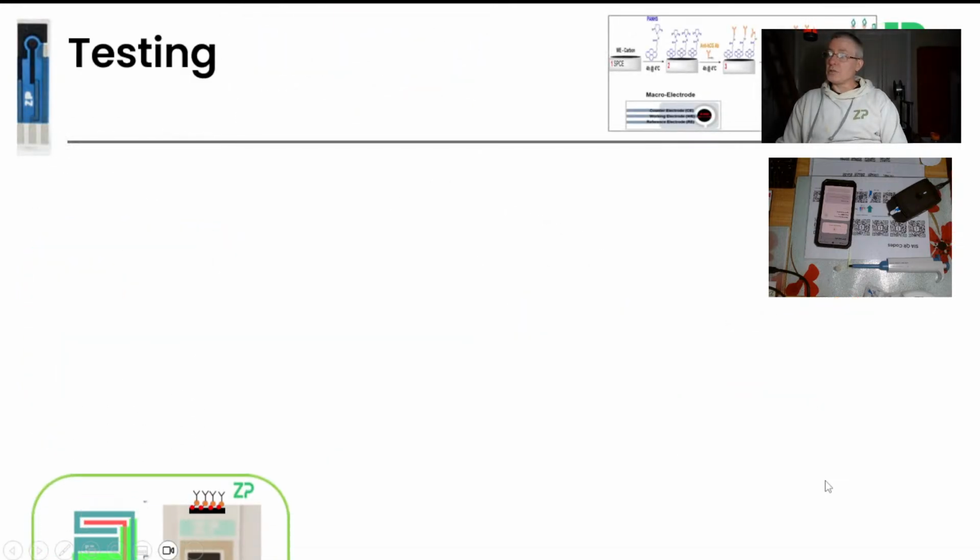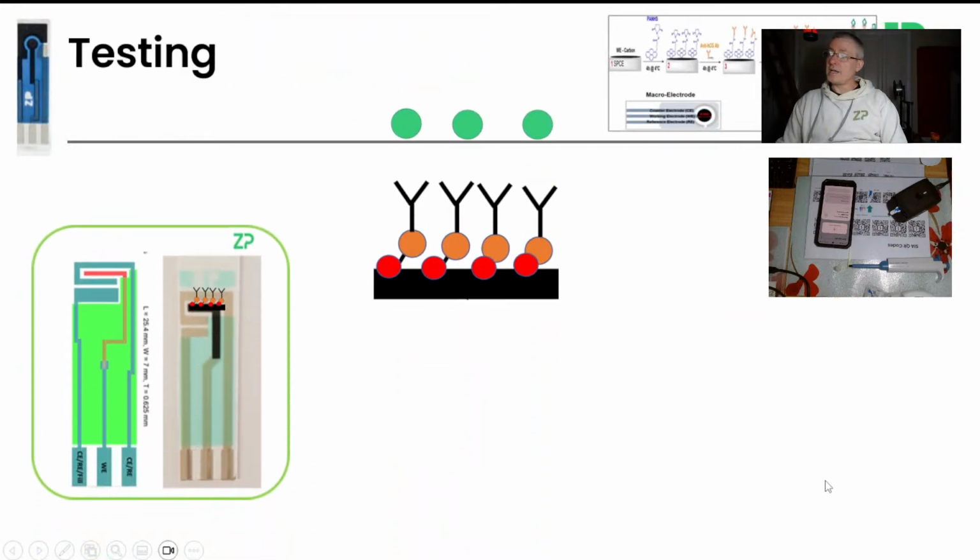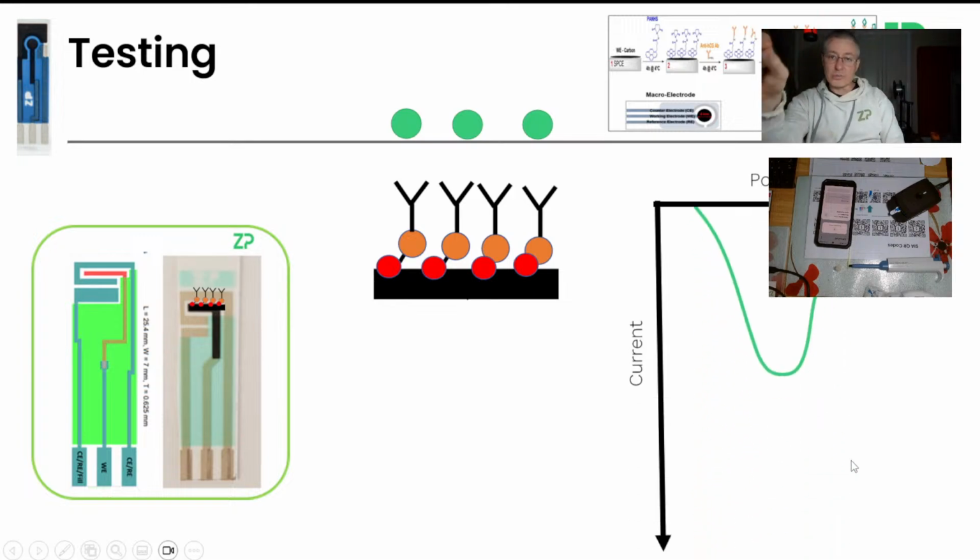So this is a paper that you can follow, and it's essentially working like a blocking assay. Rather ironically, I showed blocking assays earlier on, where when you blocked, the signal decreased. I oversimplified it because sometimes you can have blocking assays where the signal increases. When I say it increases, it's the magnitude that's increasing.